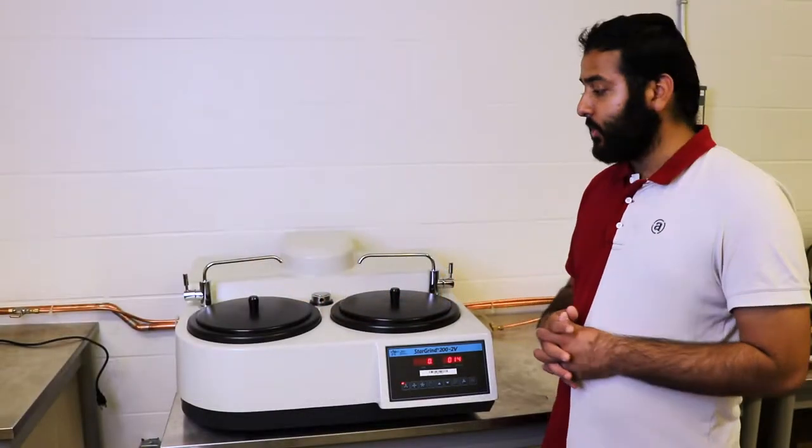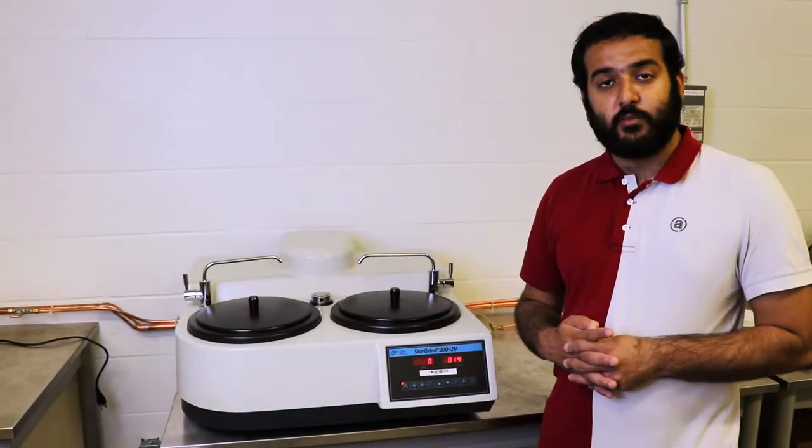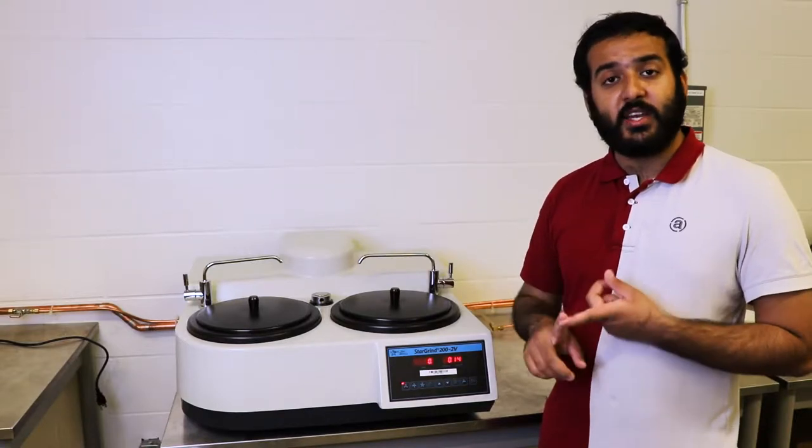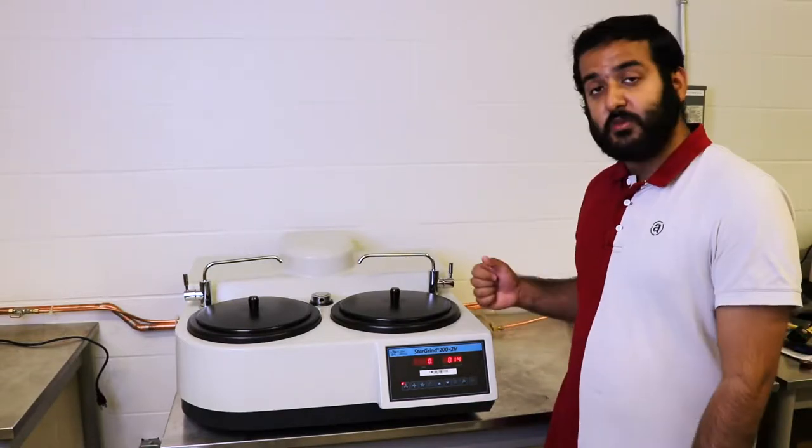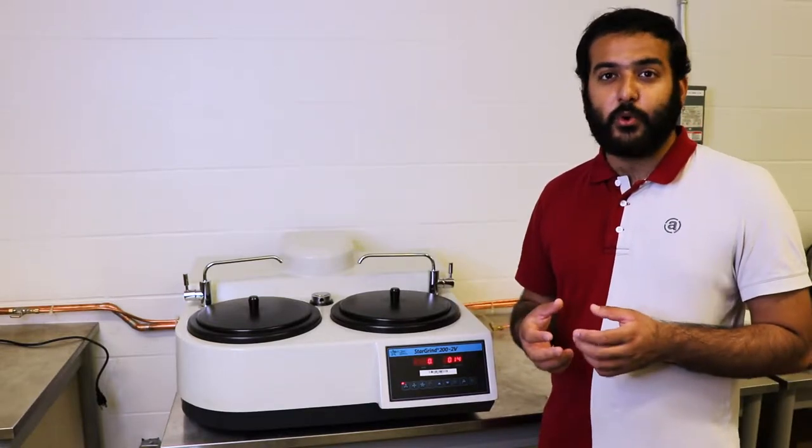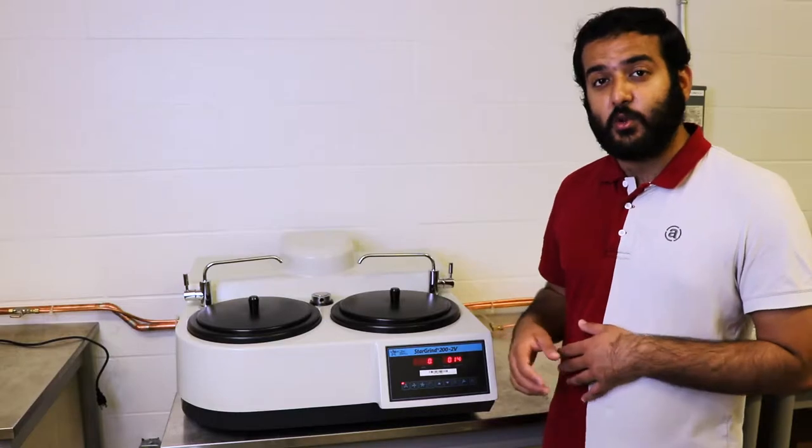Hey guys, today we're going to be showing you the polishing and grinding machine. Once you get your sample from the hot mounting machine, you need to grind it and polish it. This machine does both of those. Grinding uses grit paper, or you can call it sandpaper, something that looks like this.